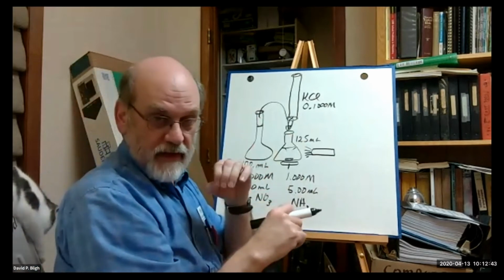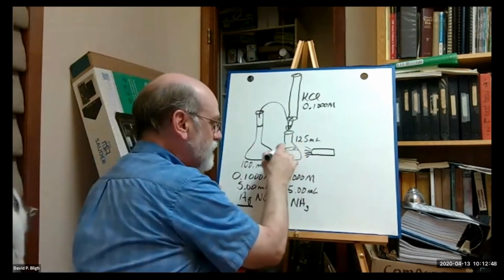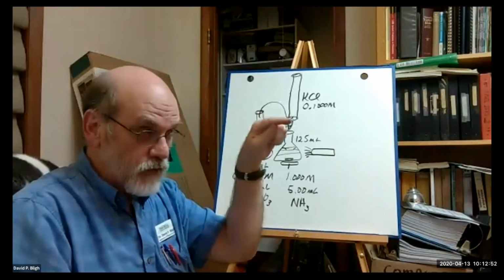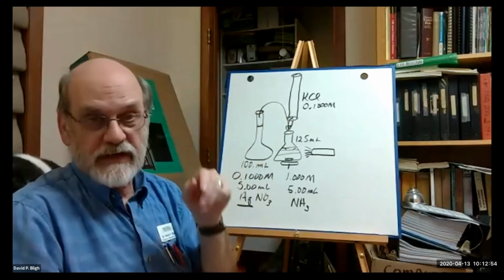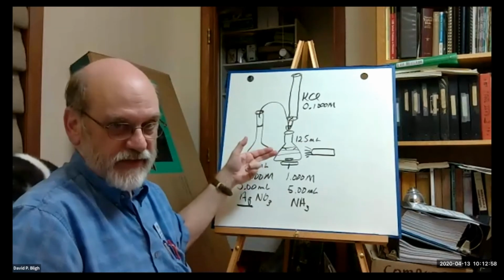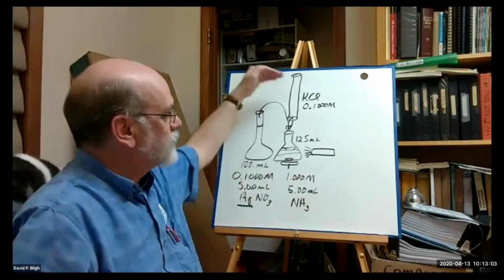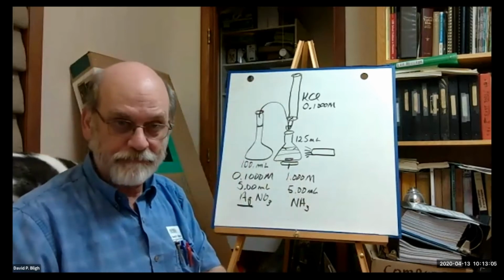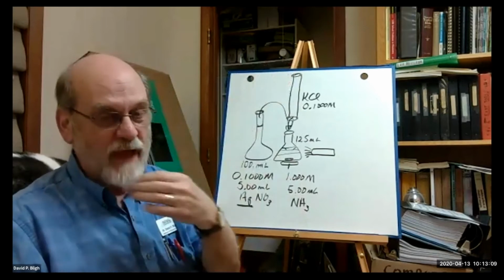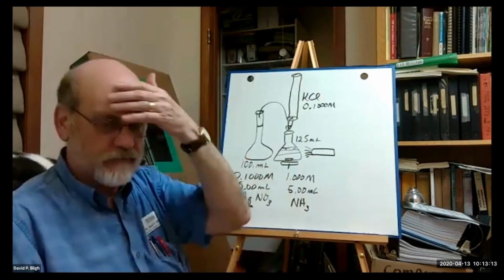But with a suspended solid or a colloid, you do see the beam. And it's easier to see that beam going through your flask if the lights are dimmed. So that's why we dim the lights. You see, when that persists, then that's your endpoint. And you take the volume, right? If you started at 0, you just read it off your burette. If you started anywhere else, you subtract that from the volume that you read, right? You all know that.